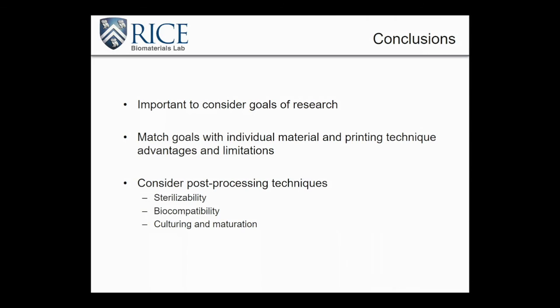And then not just deciding what type of printing process you're using, but the post-processing technique is equally as important, both in the sterilizability of your scaffolds, or in the case of, are you able to actually print in a sterile environment? You'll find that some of these printers, you're not going to be able to fit under a cell culture hood, for instance. And so you have to have some kind of strategy for the culturing and maturation of your tissue.